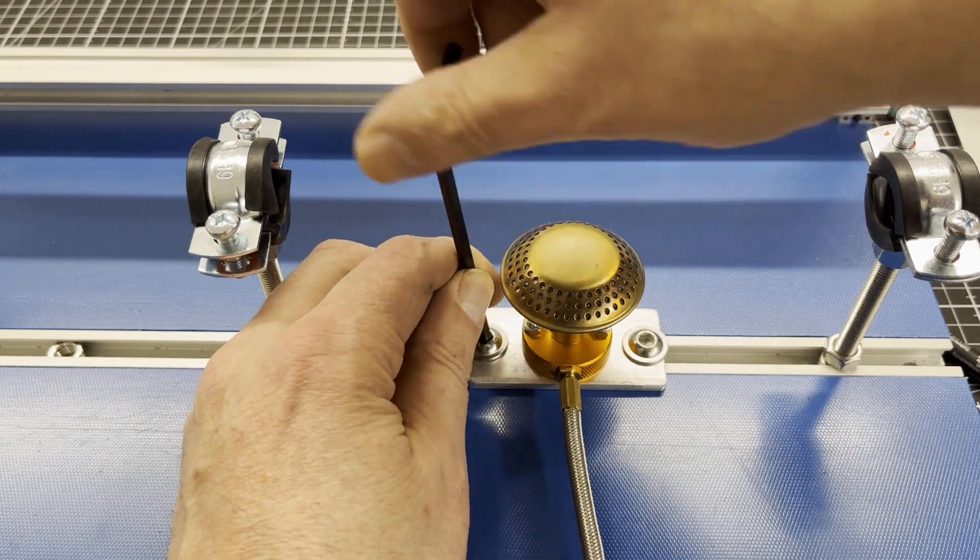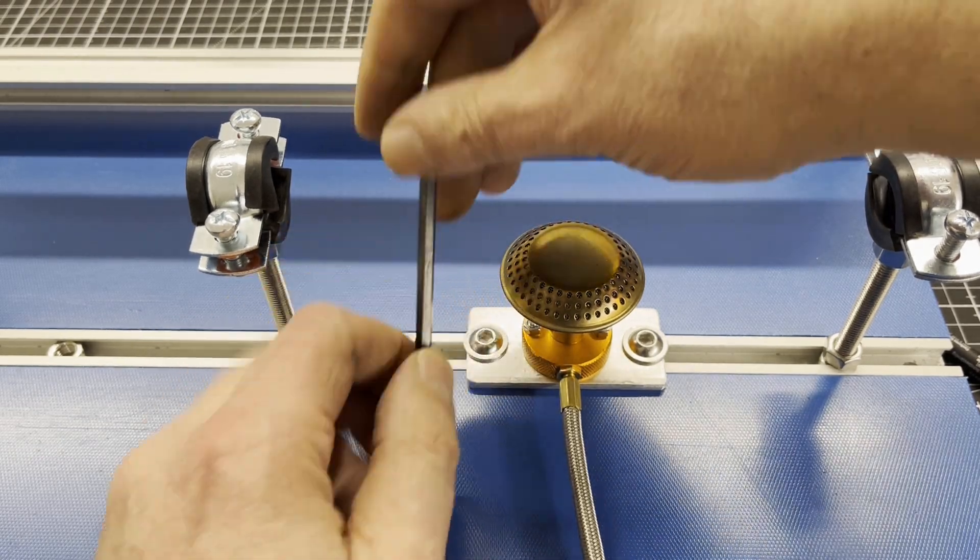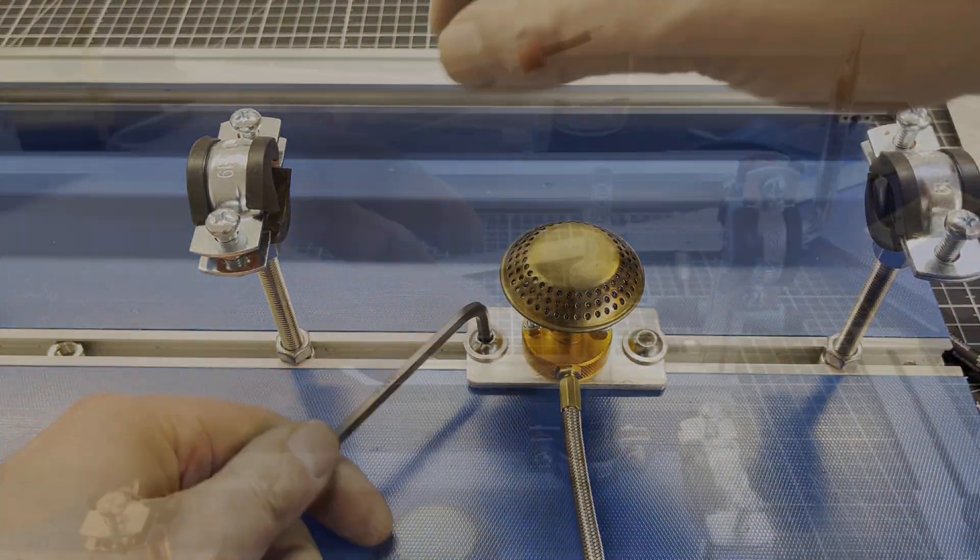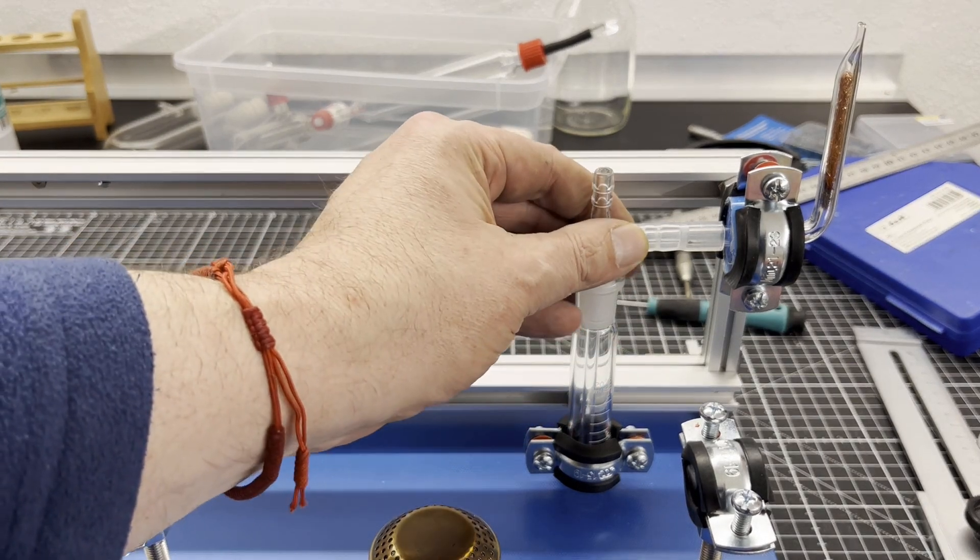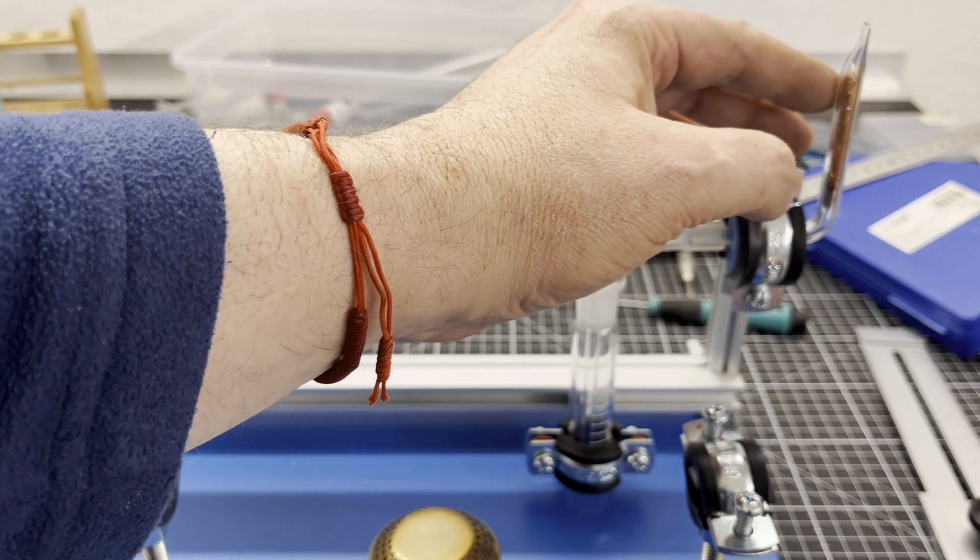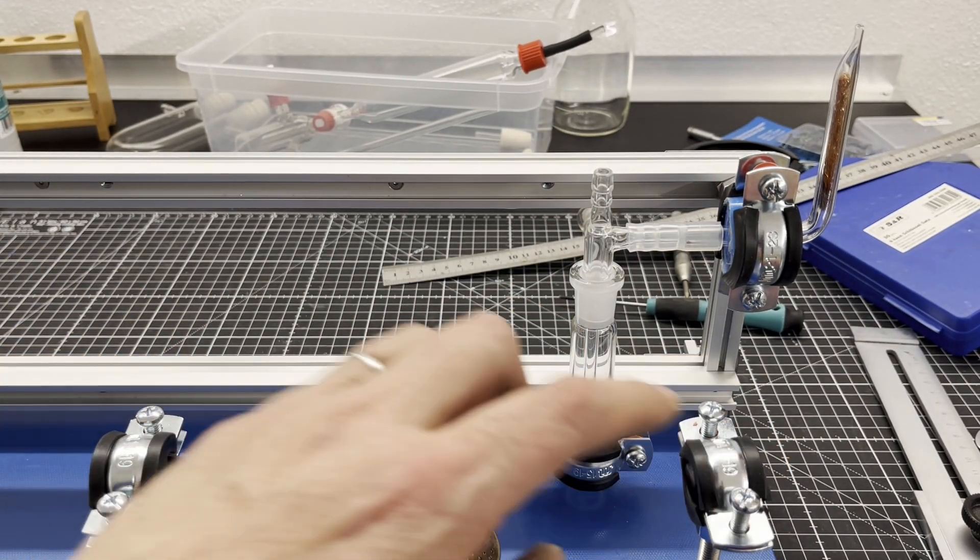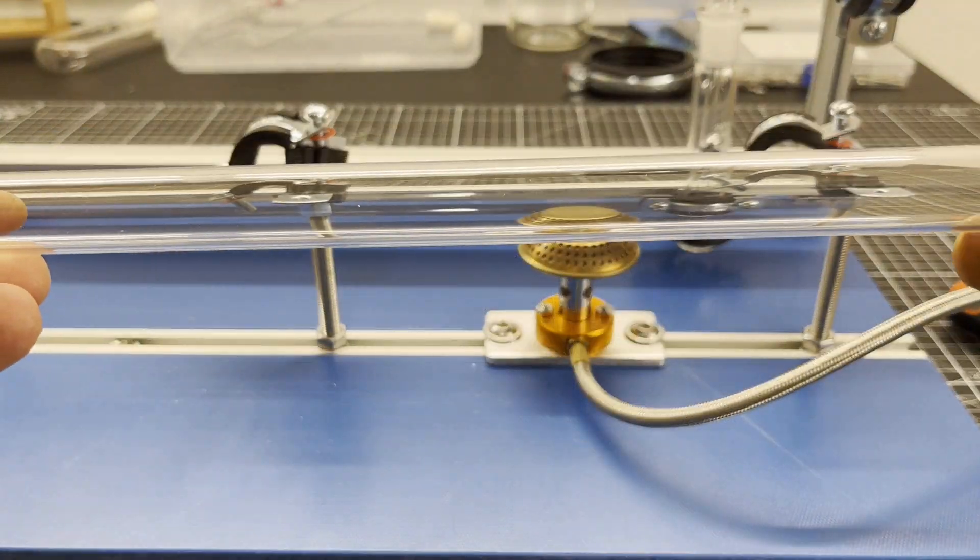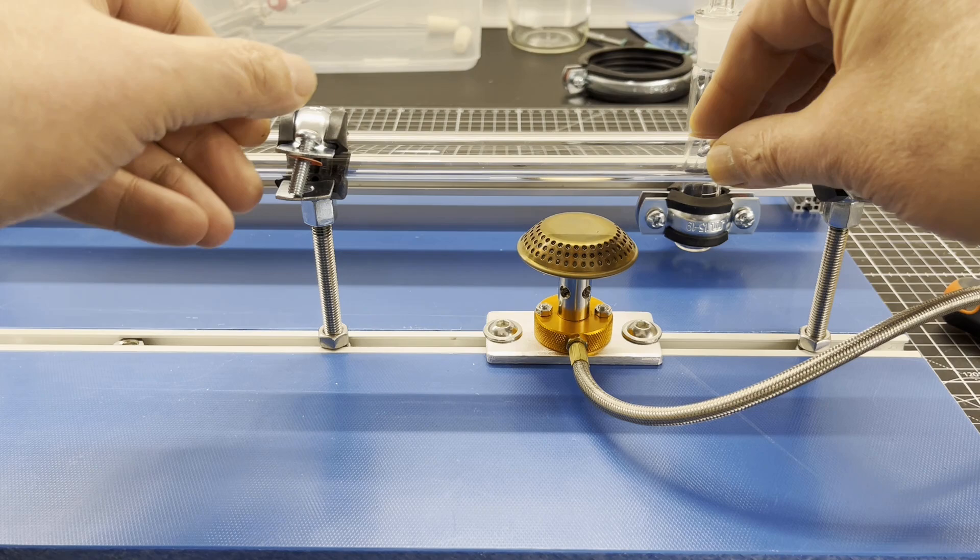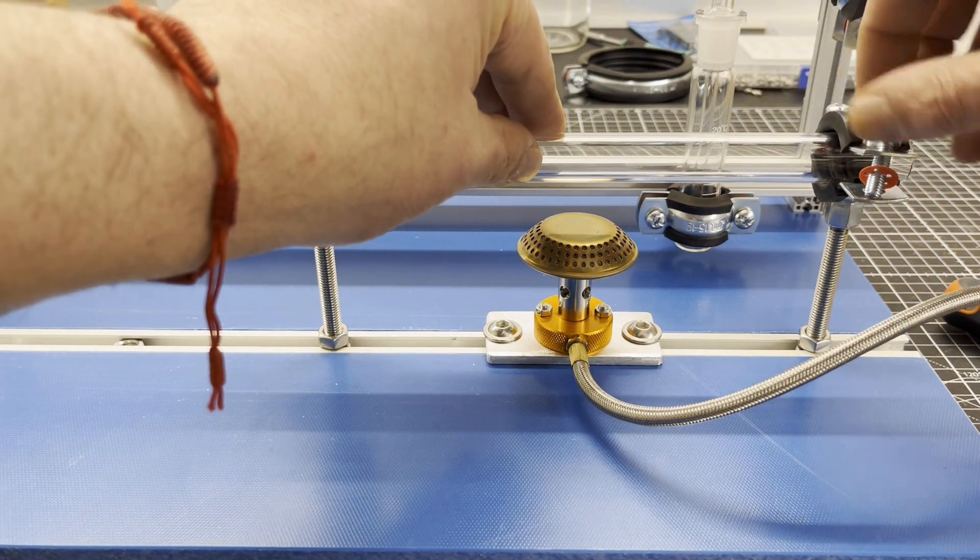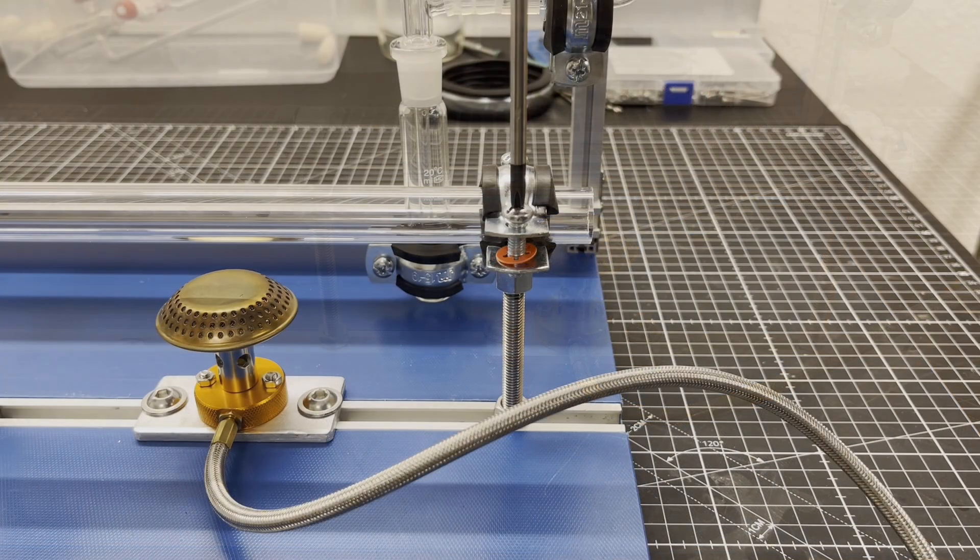You may be wondering why I don't just use lab stands and clamps. The reason is that the whole thing is not without danger because of the hydrogen. No lab stand should tip over, no clamp should come loose, and no hose should come off. I will show the rest of the construction of the apparatus without commentary in fast motion before I explain how it works.